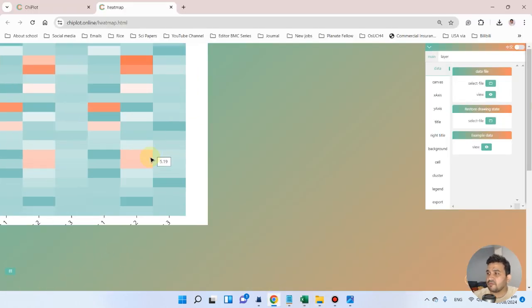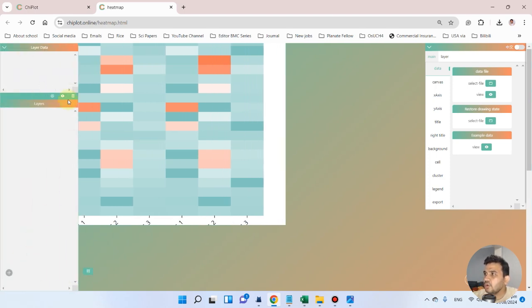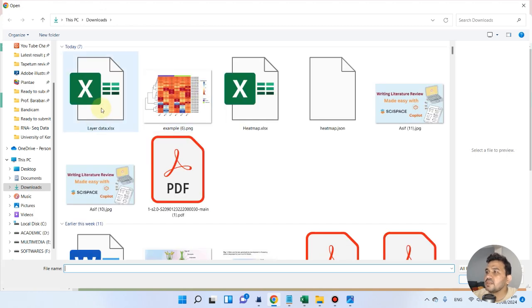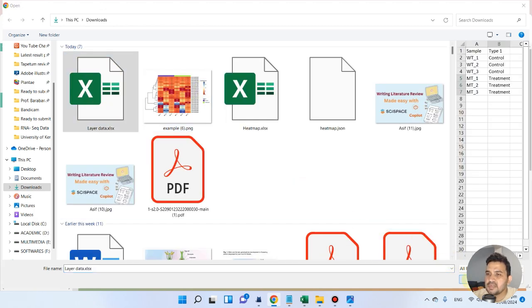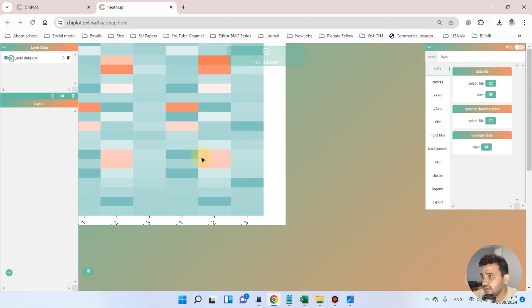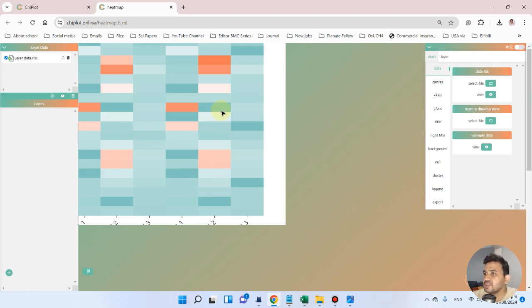Go back to the ChiPlot website and click on the layer option. Once you click it will ask you to add your layer file. Click the plus sign, select the layer file, and open it. You can see the file has been added.